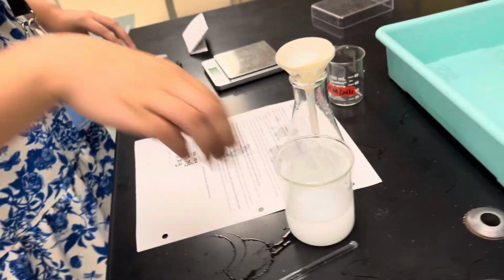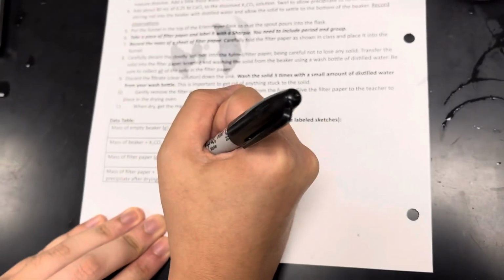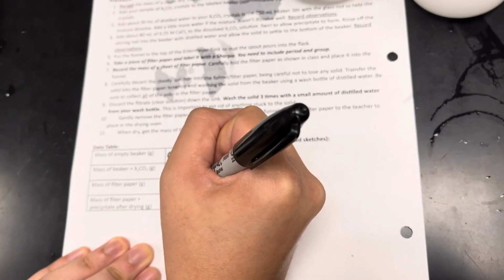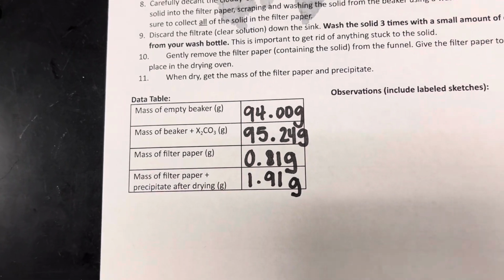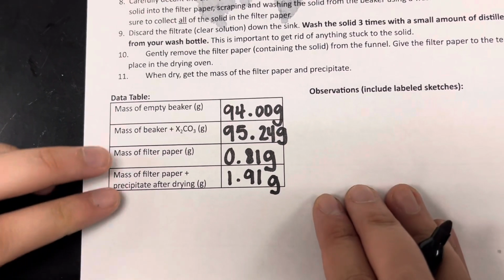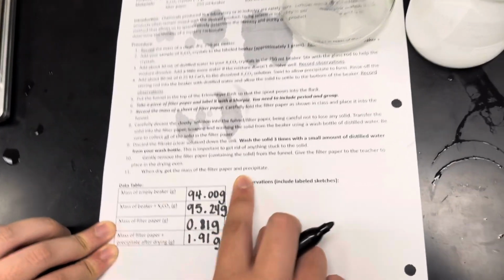But because I already did this experiment and I have the number that I got, I'm just gonna show you what number I got. I got 1.91 grams after I had my filter paper dried with the chalk. So with these two numbers, you should be able to tell how much the chalk weighed. All right, so that's step 11. When dry, get the mass of the filter paper and precipitate.